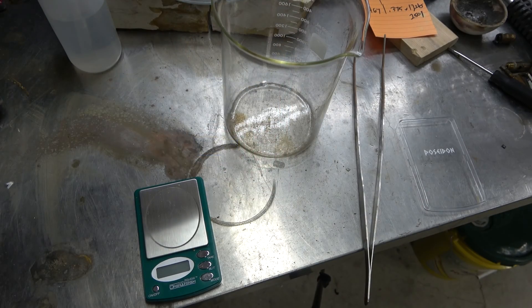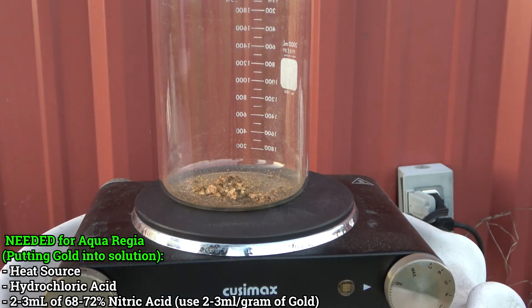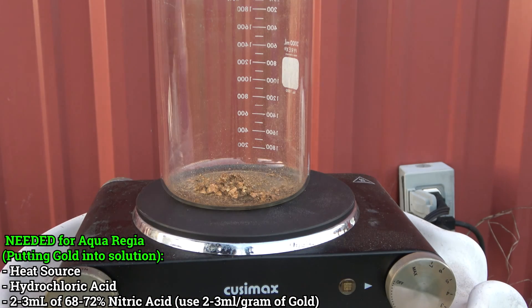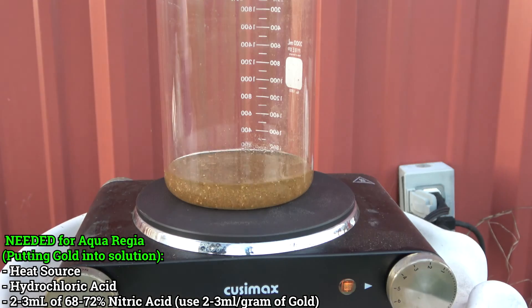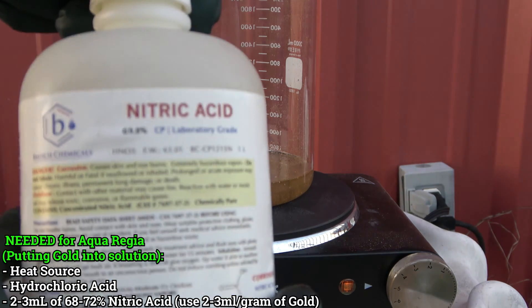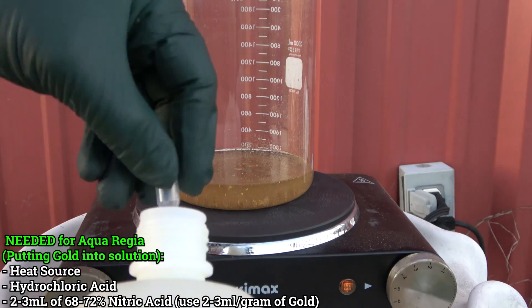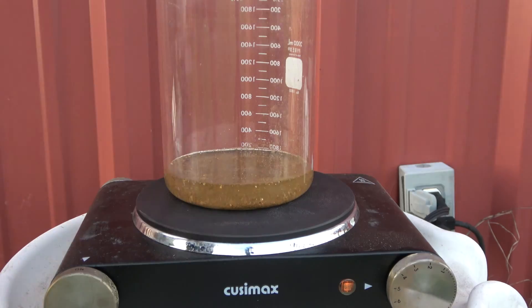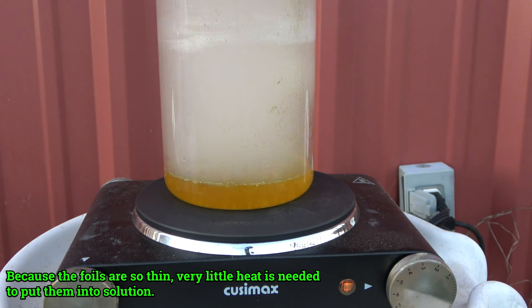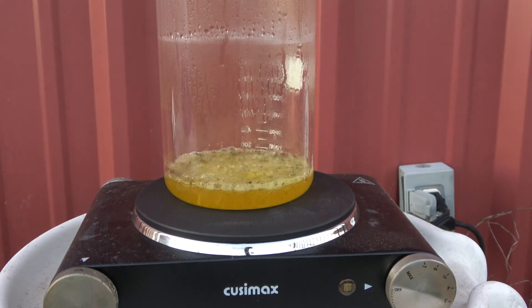At $50 to $56 per gram of gold, you can already tell this is a losing proposition. Next, we're going to put everything in aqua regia - that involves using hydrochloric acid (muriatic acid) and 2 to 3 mL of 68 to 72% nitric acid. You do not need a lot; if you use too much it's going to make your process really difficult later. With this little and this thin of gold, it doesn't need much heat. You can see even before I turned the stove on it started going into solution. Don't breathe these fumes - they are nasty. Make sure you're doing it outside and use a respirator if you have one.